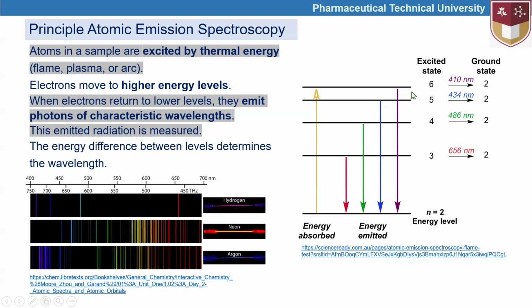And this comes from the falling of electrons from a farther distance to the ground state. So the energy released from these atoms is expected to be more than other atoms.